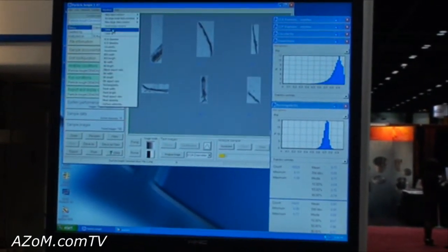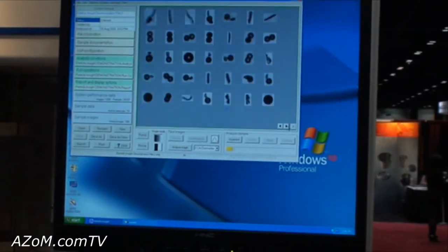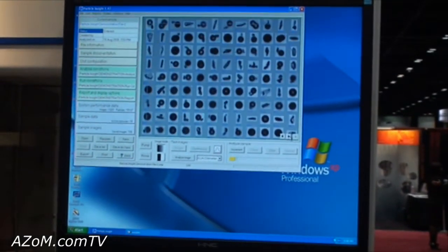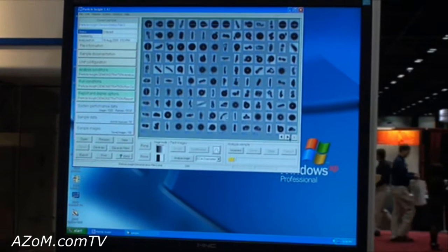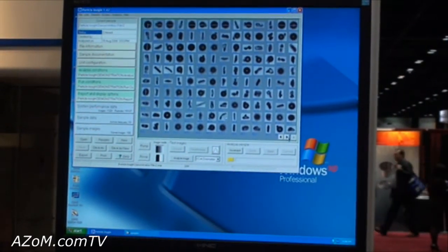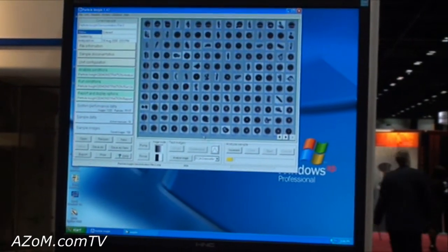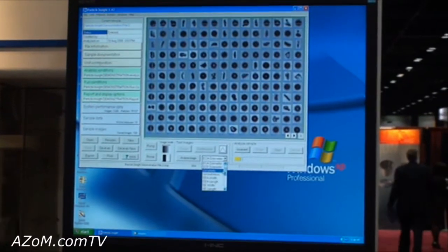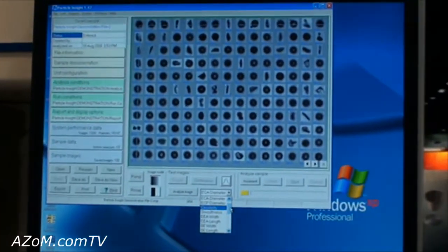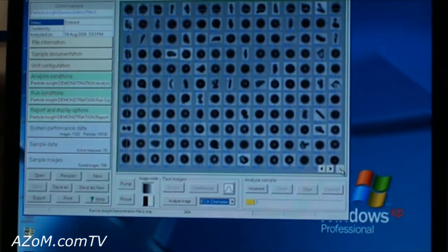So you can actually go through and do some research, look at your particles in a nice grayscale view. You can look at all the different equivalent and circular diameters. You can look at any one of the 28 different shapes you want to look at, and you can sort it any which way you want.